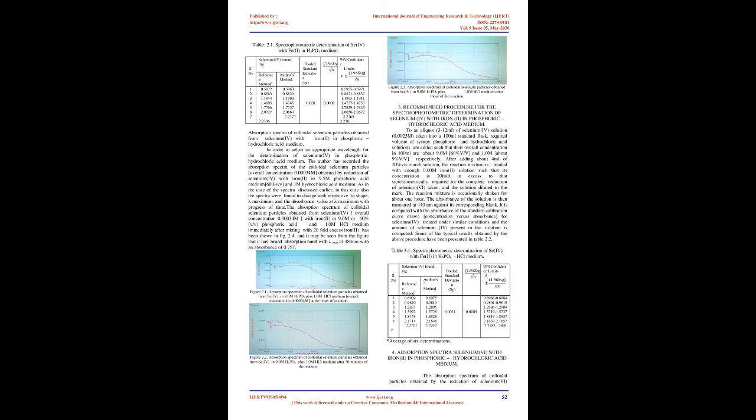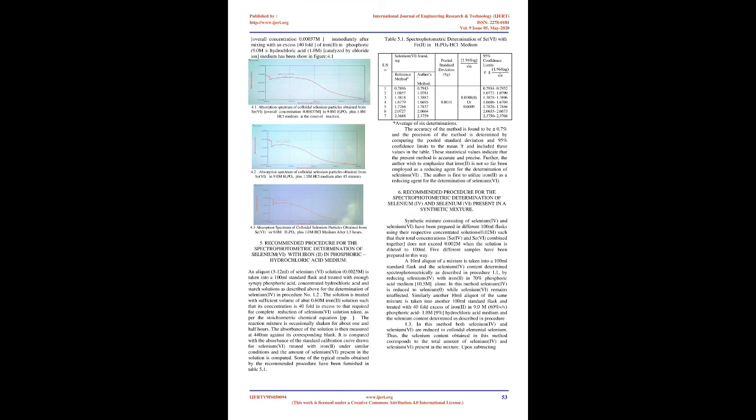It is contemplated that the highly viscous medium [50], such as phosphoric acid, where there is poor transport of the ions, is in general not conducive for the process of crystallization of the selenium colloids. This view is strengthened by the fact that the electron diffraction shown in Figure 2.10, taken from the colloidal particles obtained in 10.5 M H3PO4 medium, indicates that they were all in the amorphous phase.